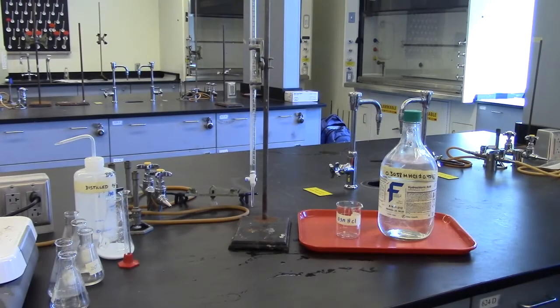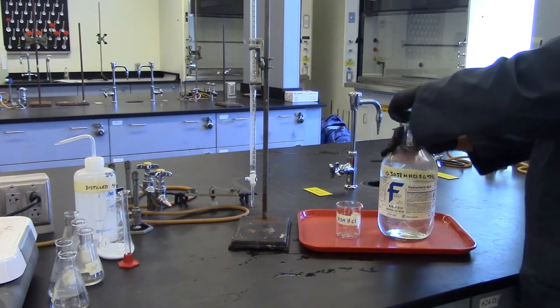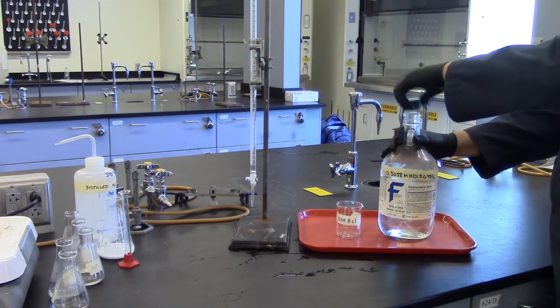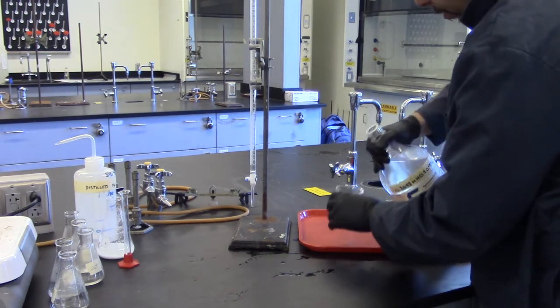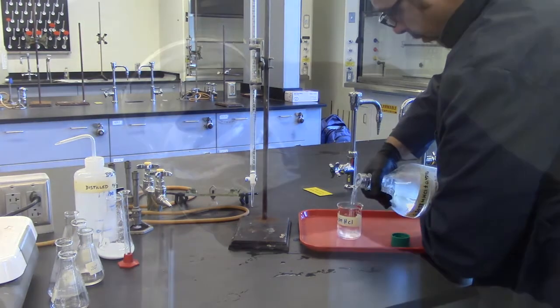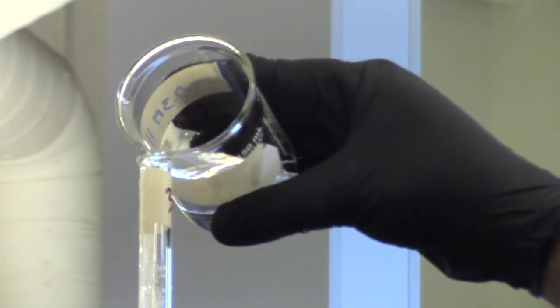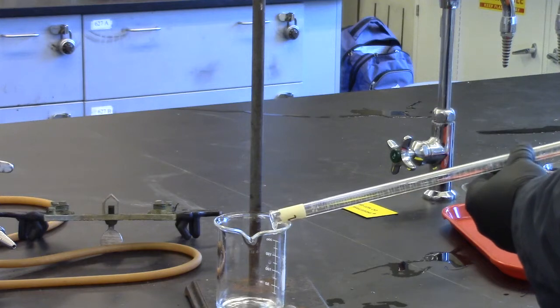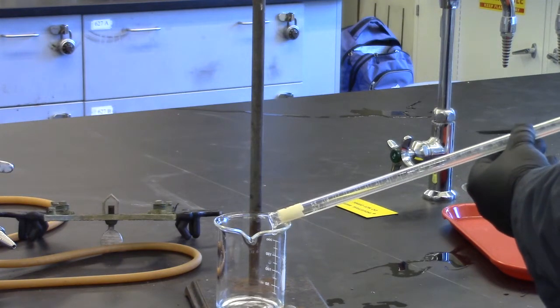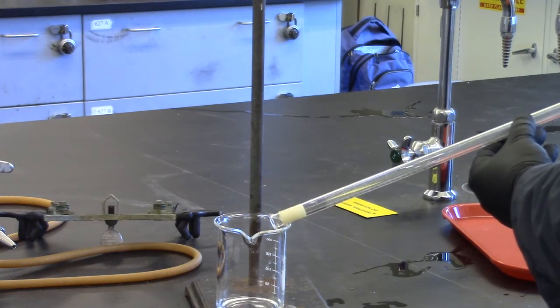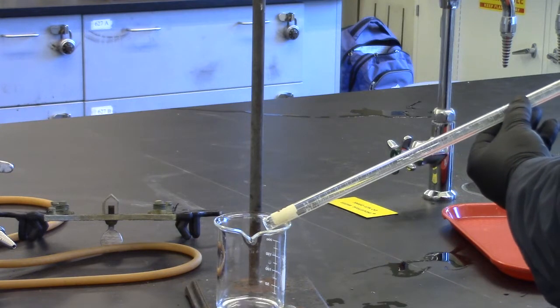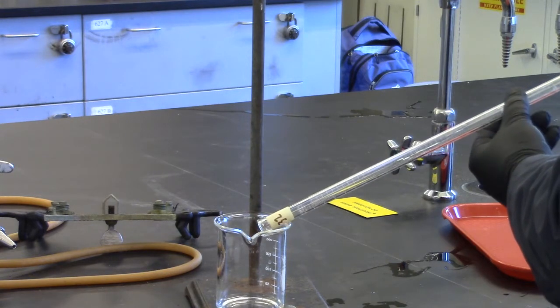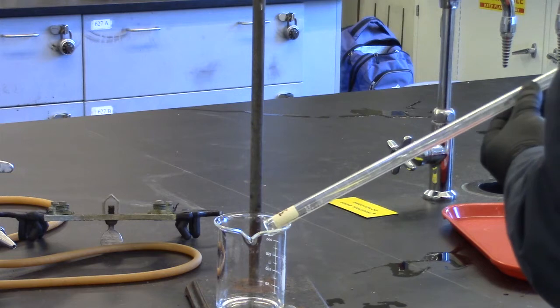We are now moving on to Part C: Titrating the borax samples. For this part, rinse a burette three times with small portions of the standardized HCl solution provided. To rinse the burette, hold the burette sideways and allow the HCl solution to wash the sides of the burette while pouring it into a beaker. Rinse the burette three times.